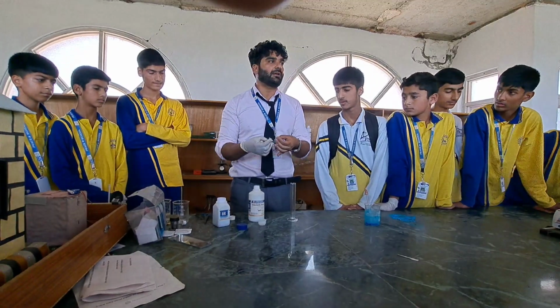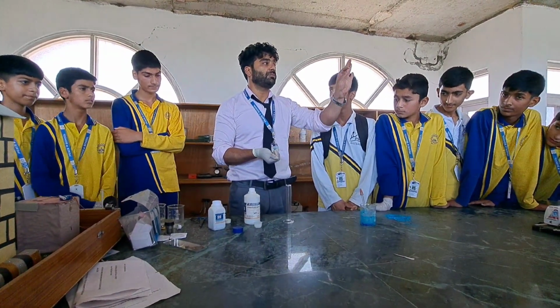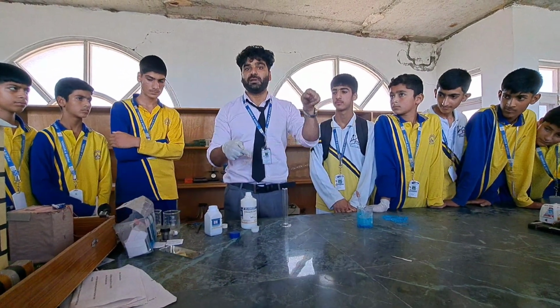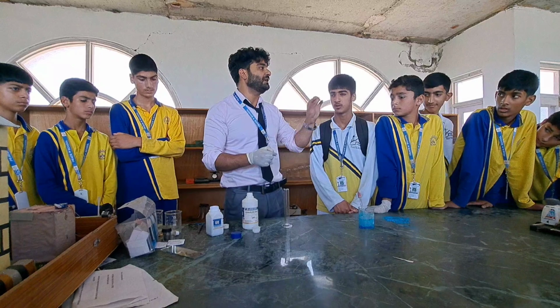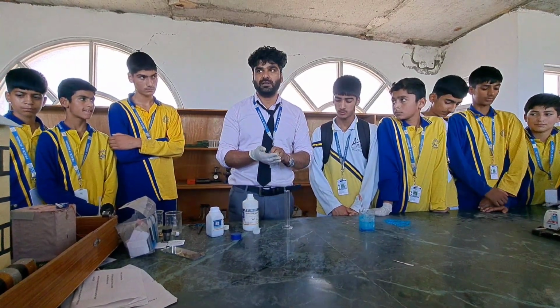In which beaker, in which vessel I will react these two substances, there will be evolution of gas, evolution of hydrogen gas, and the beaker itself will become hot, because this kind of reaction is an exothermic reaction. In this reaction, a lot of heat is produced, and let us do this thing practically.